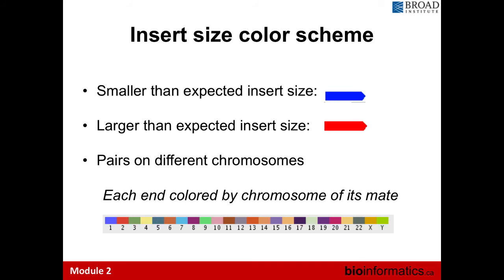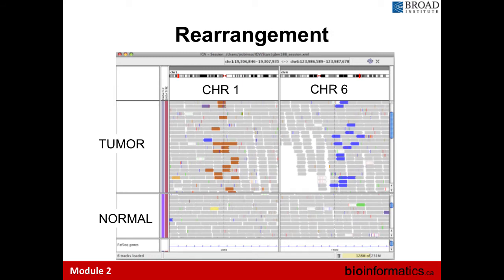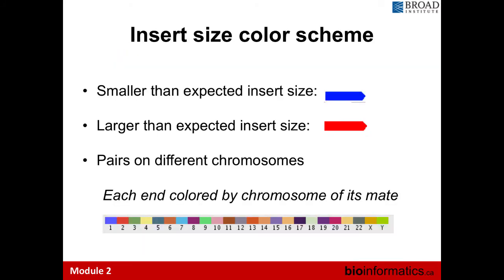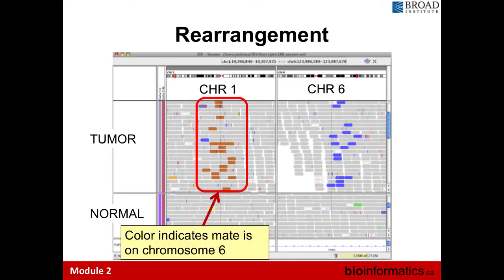Insertions give a smaller insert size than expected, and IGV colors those blue. For interchromosomal rearrangements, one read of a pair maps to one chromosome but the other maps to a completely different section. Since IGV only shows a small genome window at once, it indicates these rearrangements by coloring the mate of the read pair according to which chromosome it maps to. For example, viewing chromosome 1 and chromosome 6 simultaneously, reads on chromosome 1 colored orange indicate their mate is mapping to chromosome 6. Jumping to that location on chromosome 6, the mates are colored blue, indicating they map back to chromosome 1.